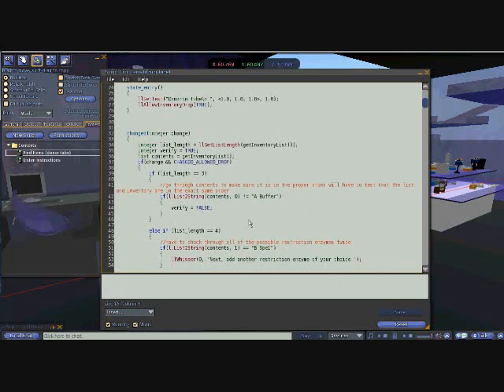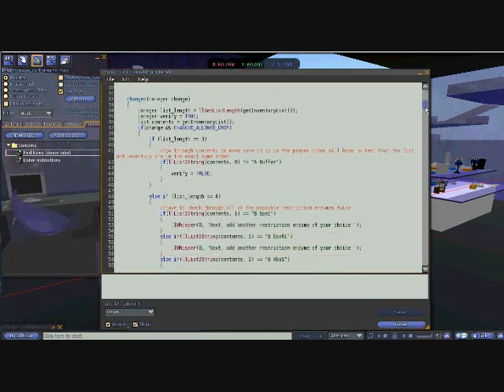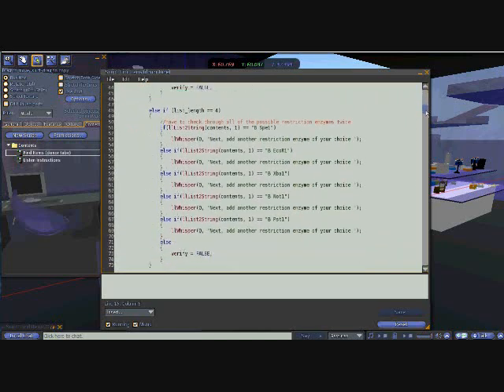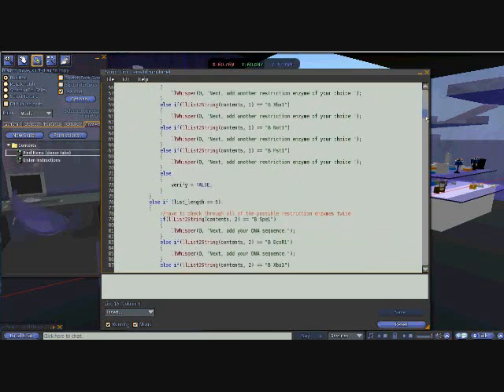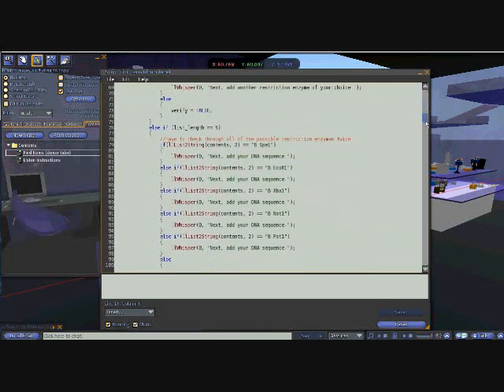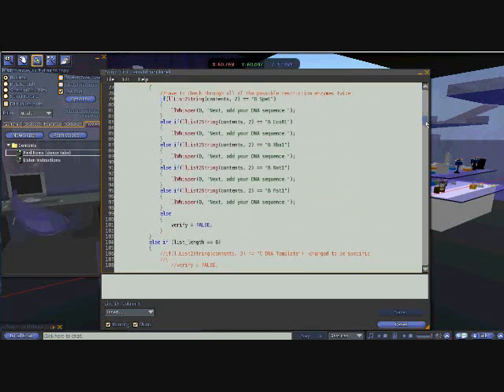So as you can see, if I were to add buffer, don't really pay attention to the names right now since they're really general, the tube will tell me that the addition was correct and that I can continue.